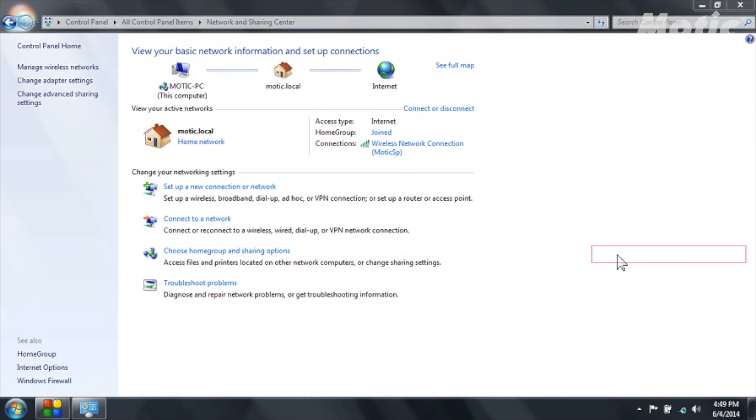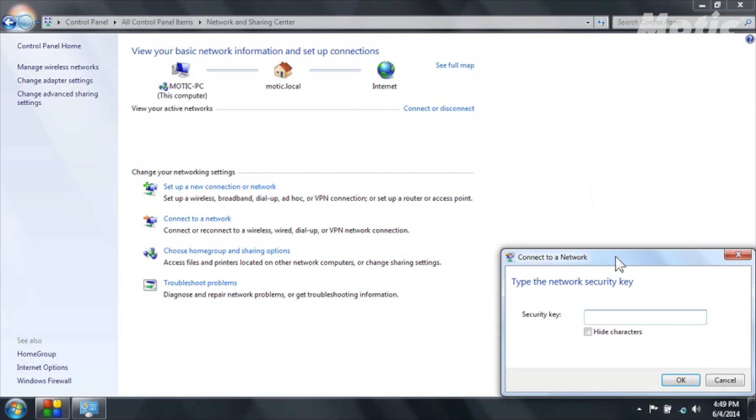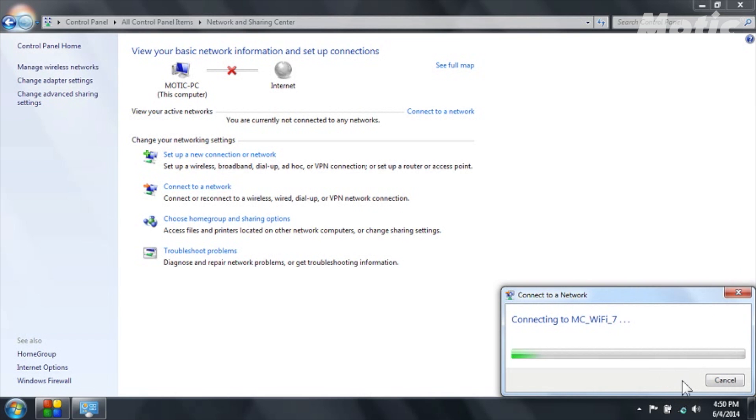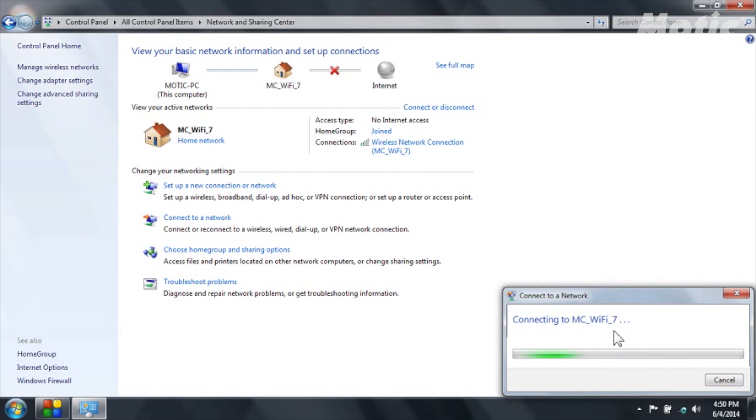So now again I double click on it and I will be asked to enter the password and the password is by default for any Modicam 12345678. And I click on OK and now I am connecting to the camera and it is done.